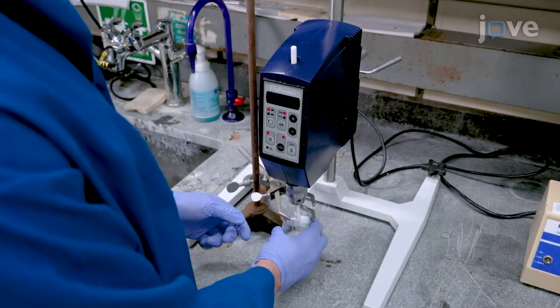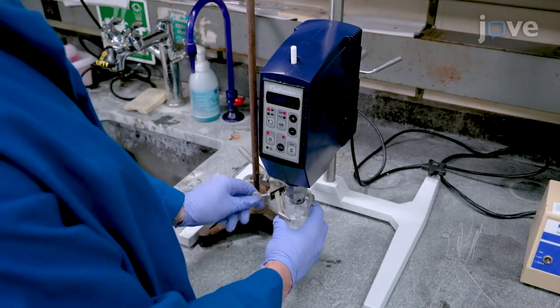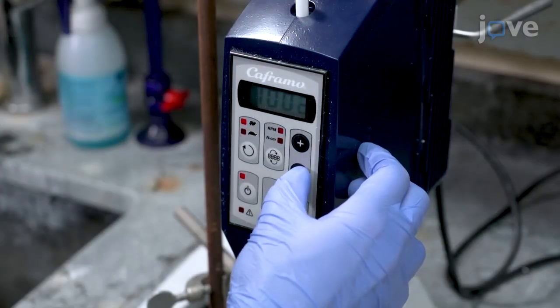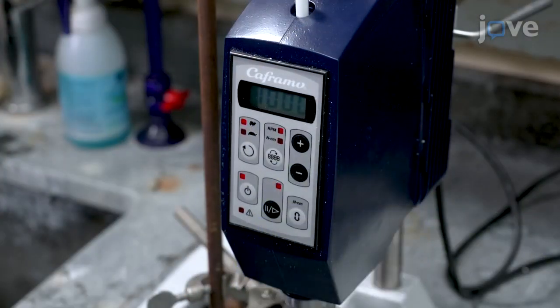Keep the beaker on an overhead paddle stirrer equipped with a plastic paddle and stir the entire mixture at 1,000 RPM for 5 minutes.